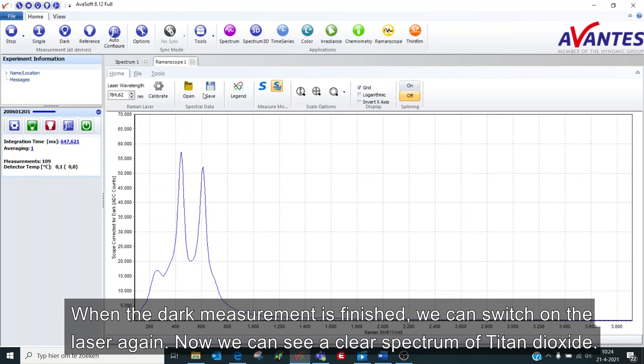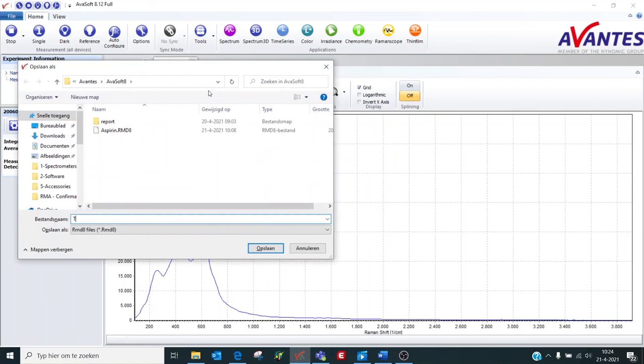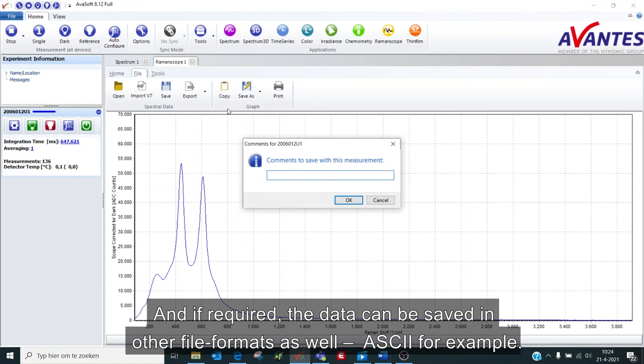You can save the spectra to your computer. And if required, the data can be saved in other file formats as well, ASCII for example.